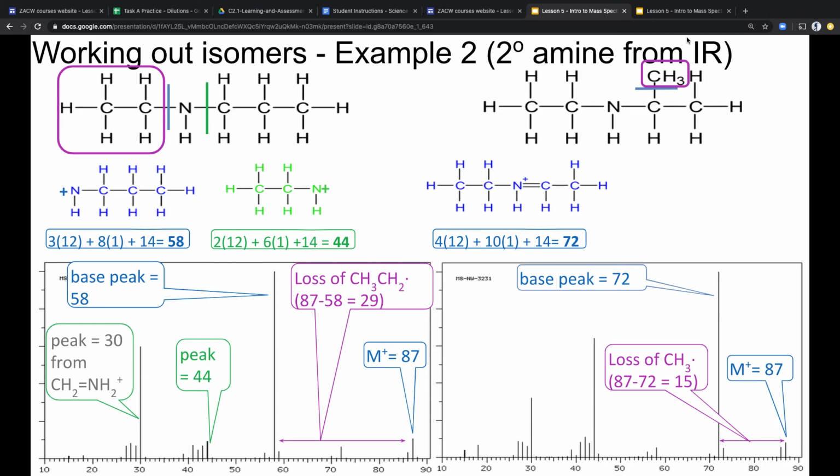And there's proof that the mass difference between the molecular ion and that base peak is 15, so we know that's proof that the methyl group was indeed the group that left. There's a peak at 44. Where do we think we can break a bond to form a peak with a mass of 44? Let's give that a go. Yeah, good on you. Awesome, Ella.